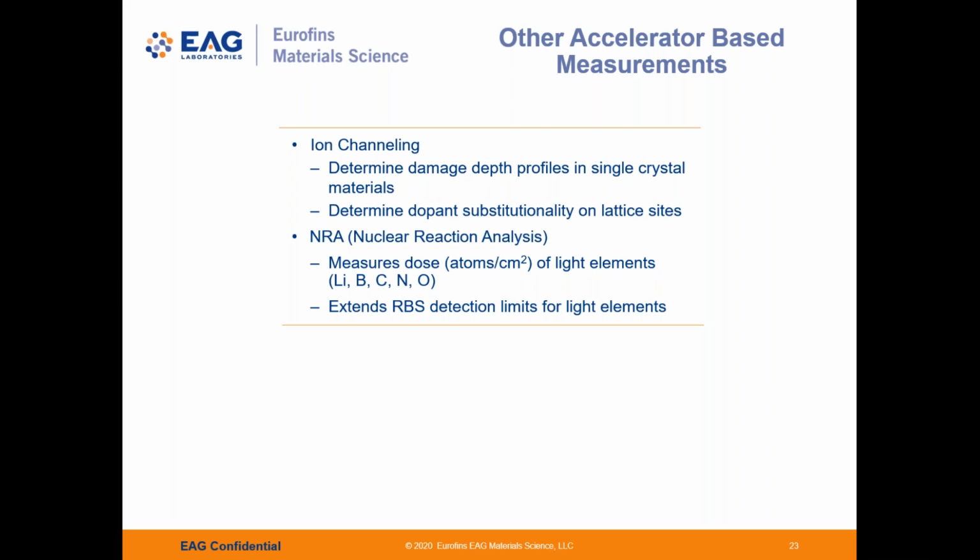Some examples of materials include both pure and doped crystalline silicon, silicon carbide, germanium, and gallium nitride.